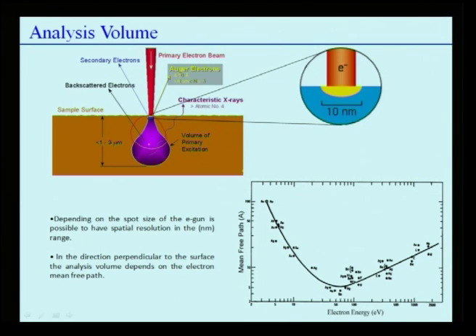But Auger, which is very significant, comes from only 4 to 50 angstrom depth, and it is only possible to get Auger excitation for atomic numbers higher than 3. So we can always get excitation from elements which have atomic number more than 3, that is, higher than lithium. That means the information coming from Auger is coming from a very small depth on the sample surface, and that's why it's a very significant tool to analyze such small features on the sample surface.